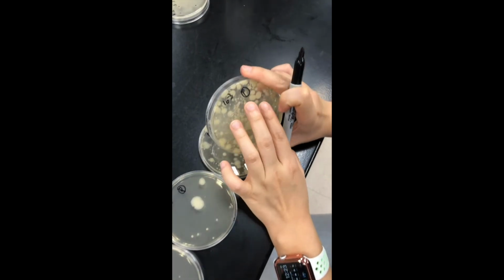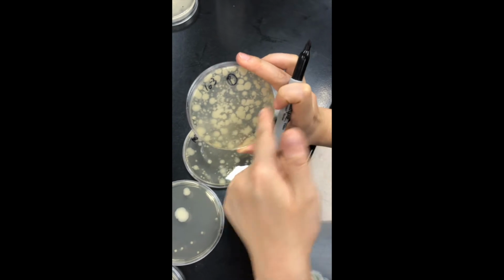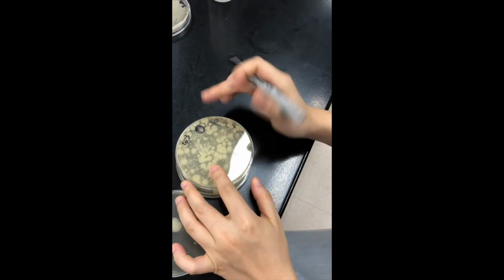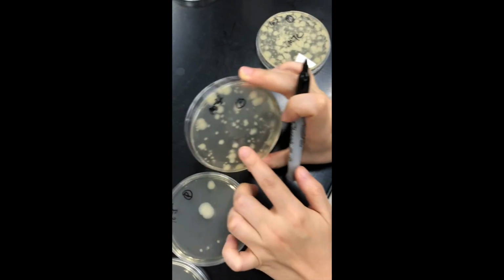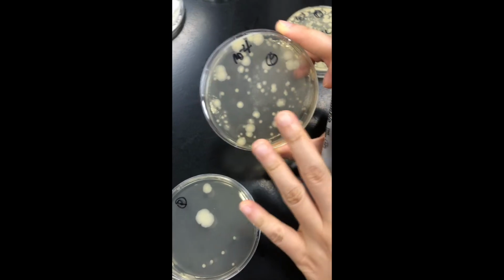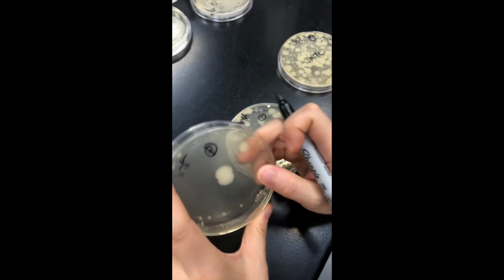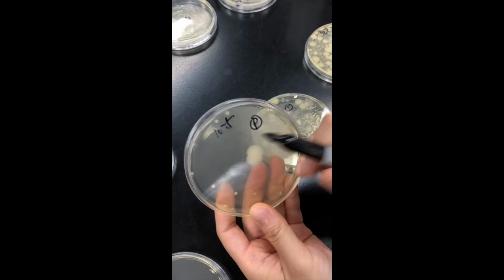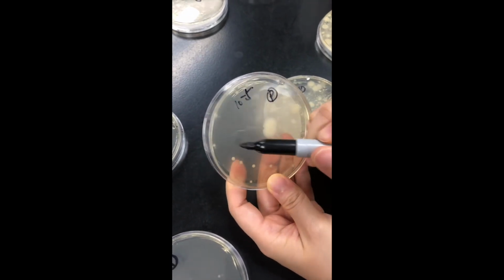This is our pasteurized raw milk sample from our 10 to the minus 3 dilution, and here too many to count. How about this plate? I'm going to count this plate because maybe it's between 30 and 300, and I'll show you the number after I finish counting the cells. And this plate is from our 10 to the minus 5 pasteurized raw milk sample.